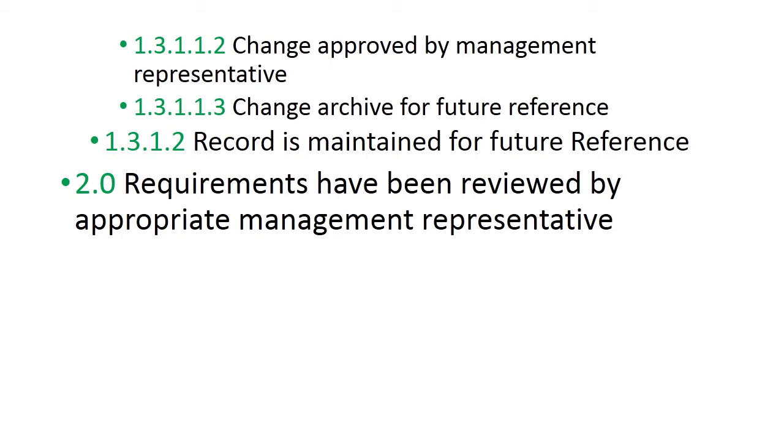Next point says change archive for future reference. Whatever change you make in this design document should be archived properly, so that in future we can take reference as to what the need was for making such a change in a previously approved document. Record is maintained for future reference.